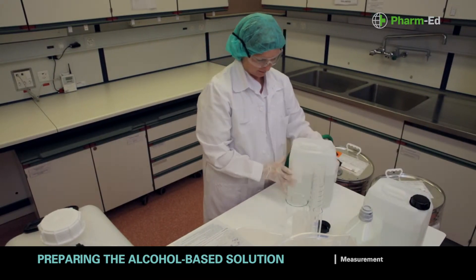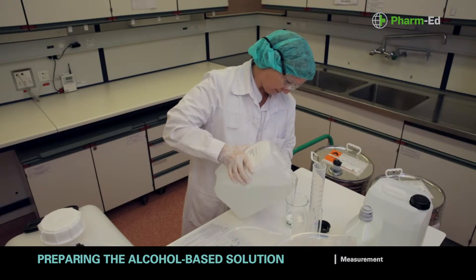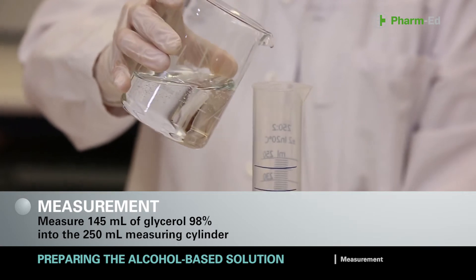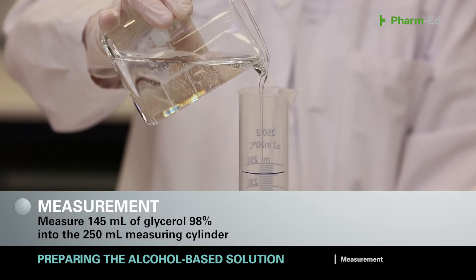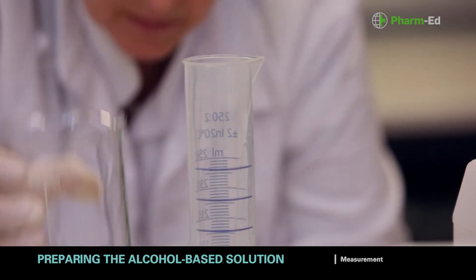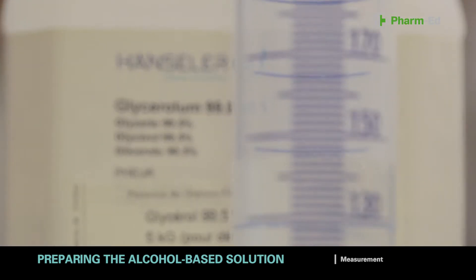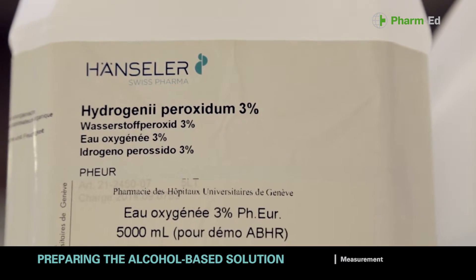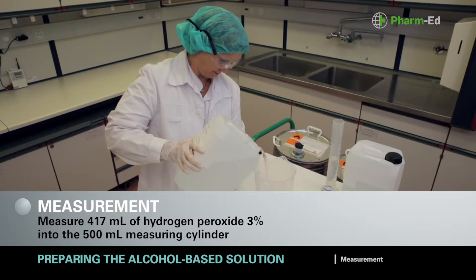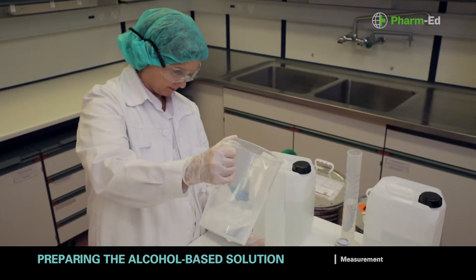Measure 145 millilitres of glycerol 98% into the 250 millilitre measuring cylinder. To make it easier to measure into the cylinder, use a funnel or transfer it into a beaker first. Avoid allowing the viscous glycerol to run down the sides of the cylinder as much as possible. Take the volume reading by placing your eye level with the meniscus and reading off the value at the base of the meniscus. Measure 417 millilitres of hydrogen peroxide 3% into the 500 millilitre measuring cylinder, taking the reading in the same way as for the glycerol.